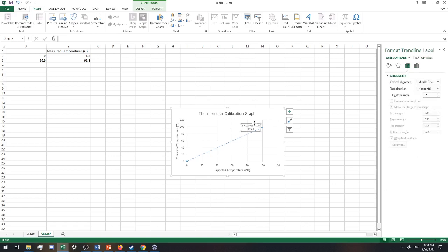The important part about r-squared is that the closer it is to 1, the more linear your data is. So you may get something like 0.98 in future labs. This particular lab will always say 1 because you only have 2 points, and you can always draw a line directly through 2 points. But as you get more points, it may not always be perfectly linear.